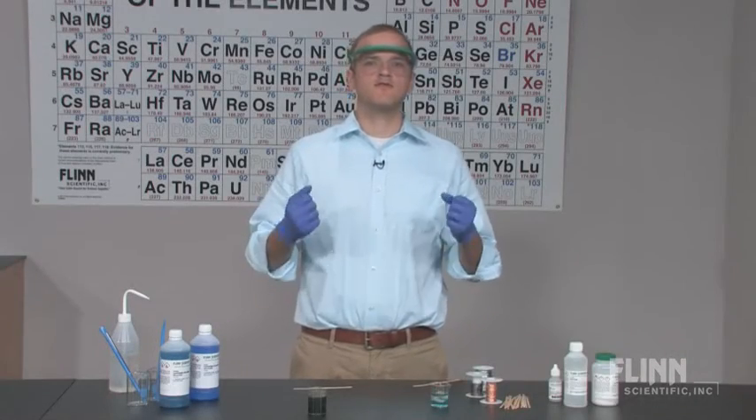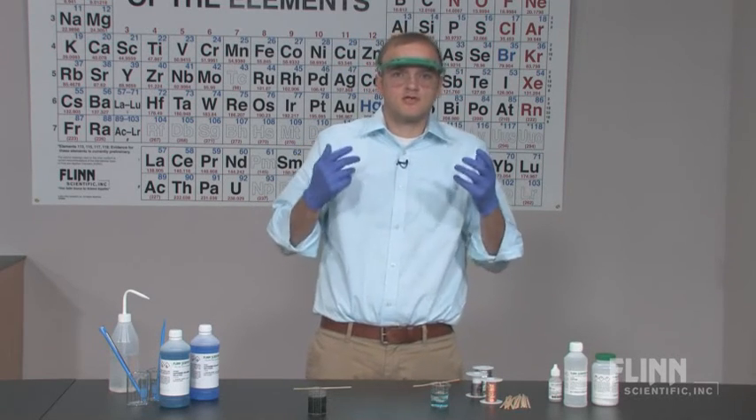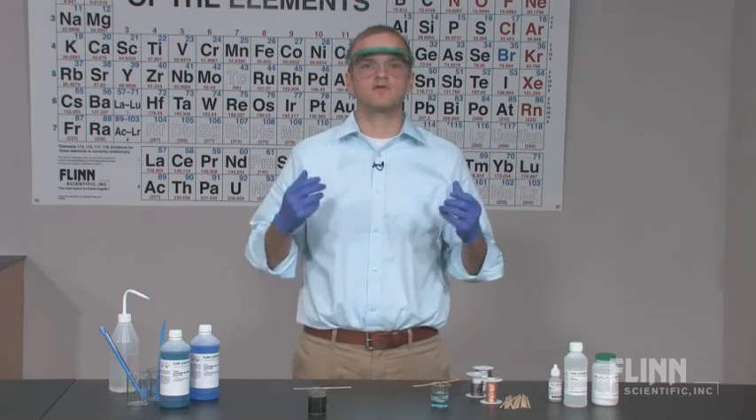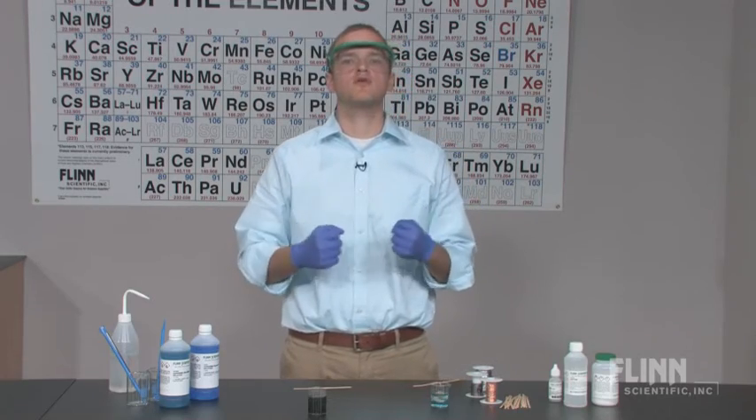However you decide to use Flinn's mole ratios kit — to teach stoichiometry and redox chemistry, or simply to wow students by growing beautiful crystals before their eyes — you can be sure that it will get the job done.